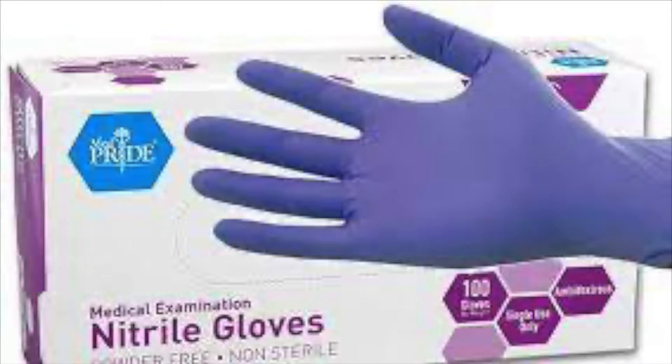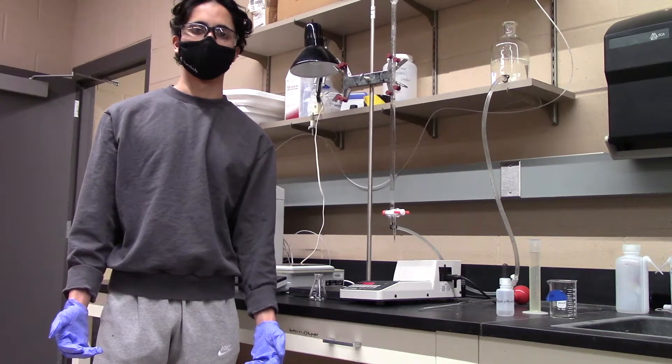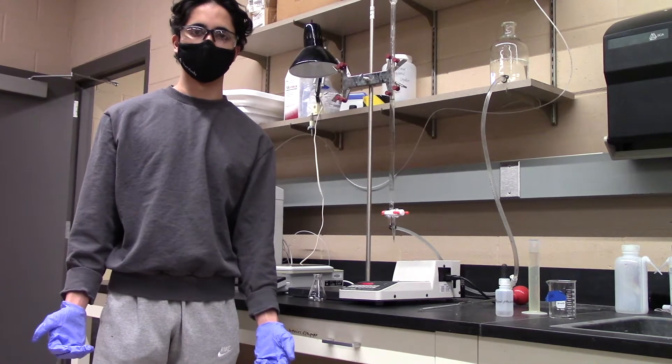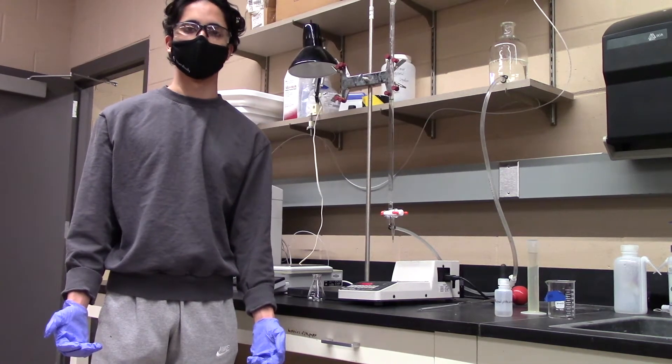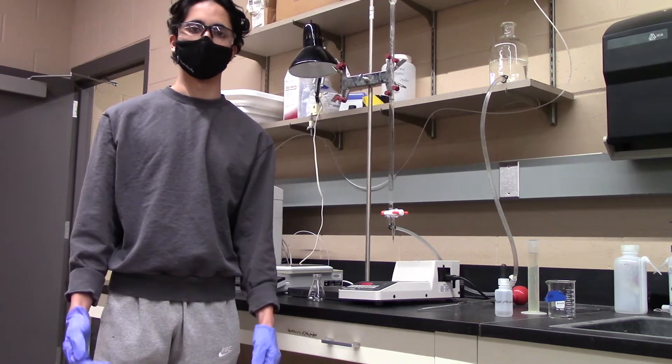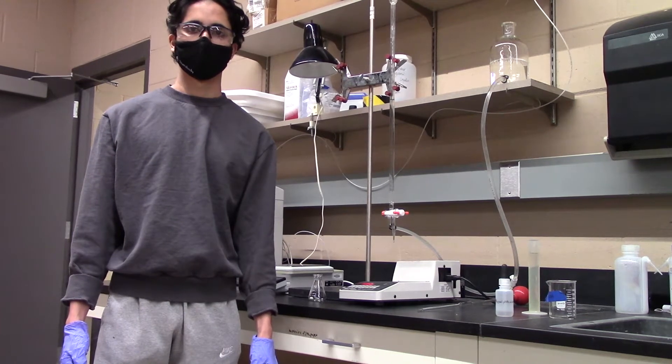Since this experiment involves the use of caustic sodium hydroxide, it is essential to wear gloves throughout the duration of the procedure. As the reaction rate constant is determined through both titration and conductivity, it is important to standardize both your NaOH and HCl solutions.